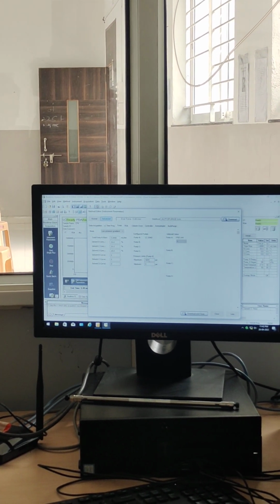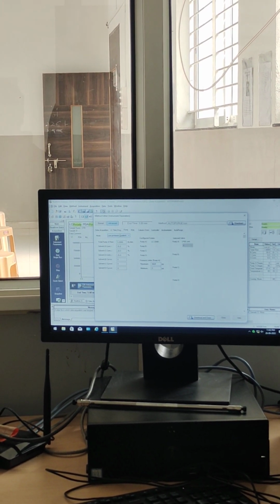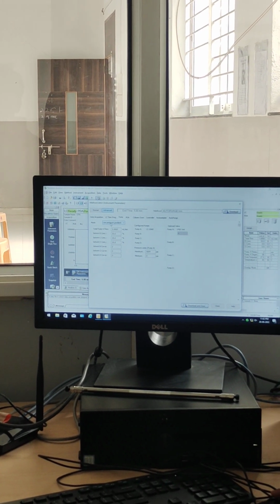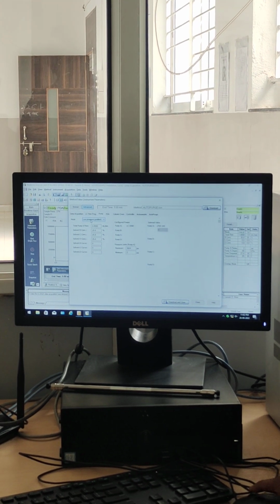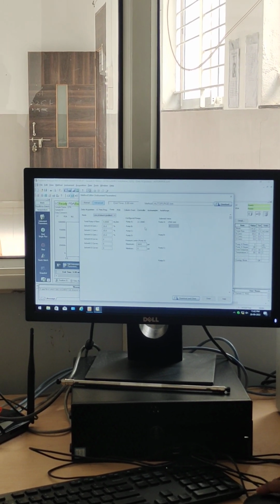Okay. And pressure we will give 5000. After that, the pump is coming. Which system do we have to use? Gradient, because we have to purge all the ports. That's why we have to use the gradient system. Flow rate 5 ml, correct? Pressure we are giving 5000.